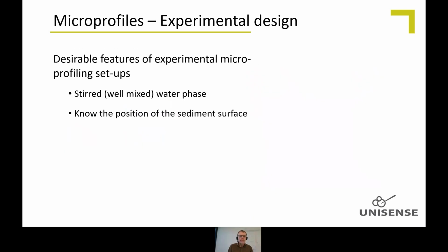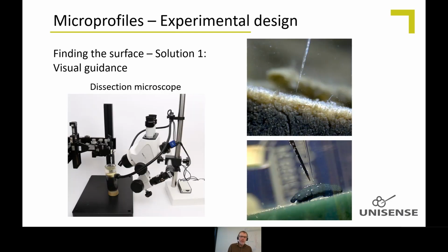So then when you do profiles, in a mixed water phase, you also need to know where the sediment surface is relative to the microsensor. There are a couple of ways of doing this. One is using a dissection microscope as here. We actually sell this size setup.